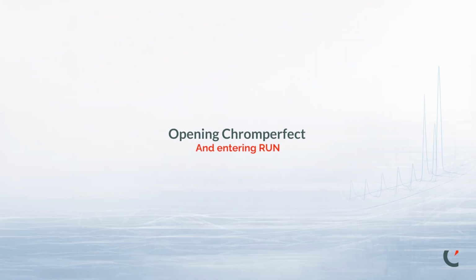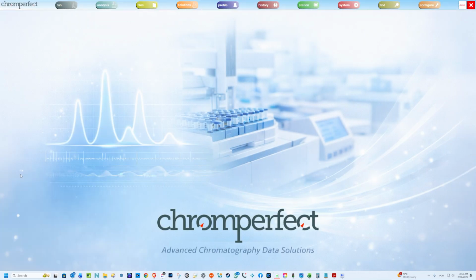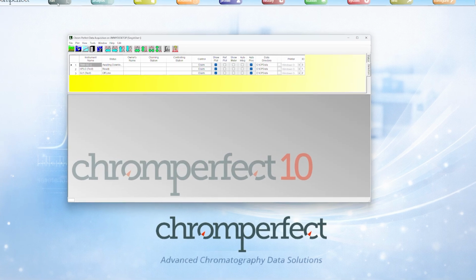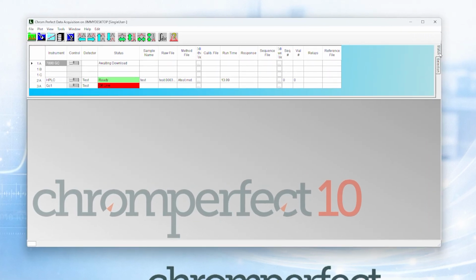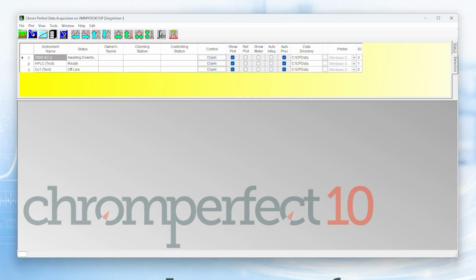Opening Chromperfect and entering Run. When the Chromperfect main menu appears, you will see several program options. For acquisition, select Run. Run is where instrument communication and data acquisition take place. When Run opens, you will see two main views: the Status tab, shown in blue, and the Selection tab, shown in yellow. The Status tab displays instrument condition and activity. The Selection tab contains configuration elements, including the data directory and display options. You will switch between these two tabs during the acquisition process.